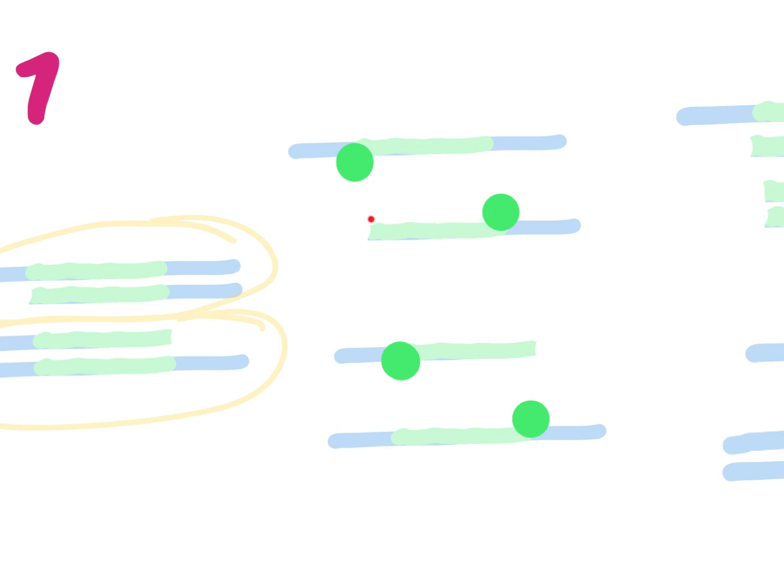Of course, it gets to the end. Now this is the point where we're starting to get some actual fragments of target DNA. And on these two strands, we've got DNA polymerase. And in that direction again, we're going to make a copy of the template only DNA, and this one we're going to get the variable length DNA fragment created.